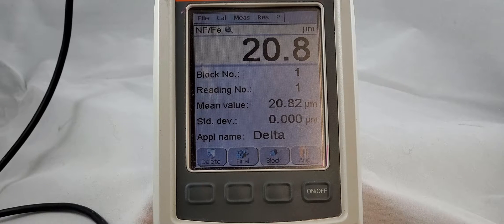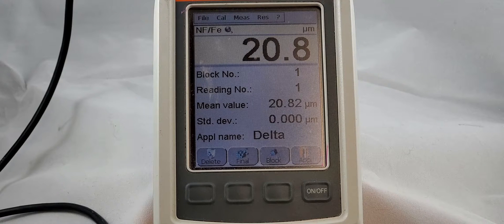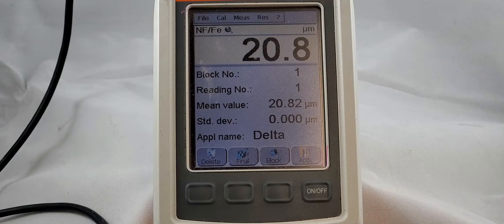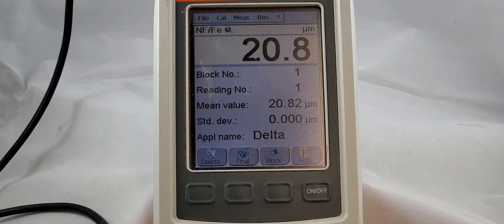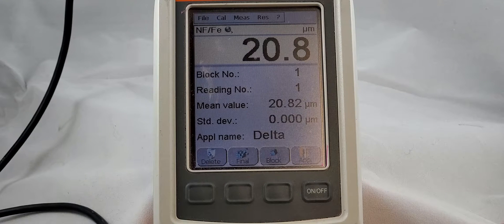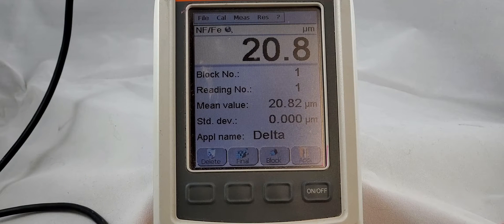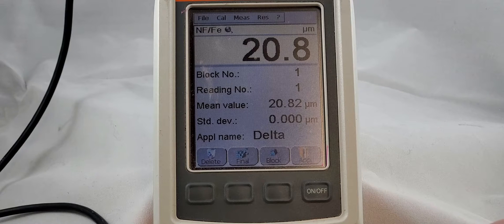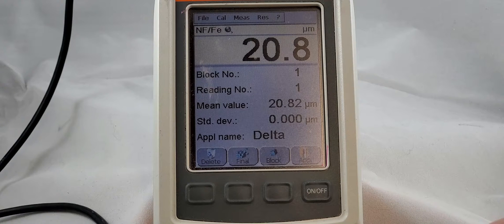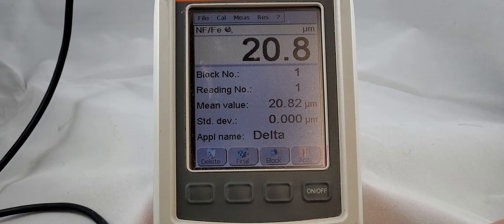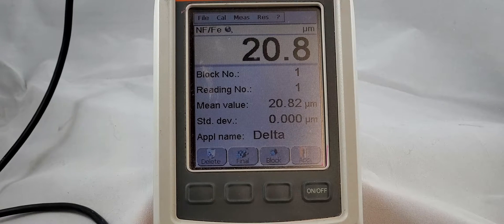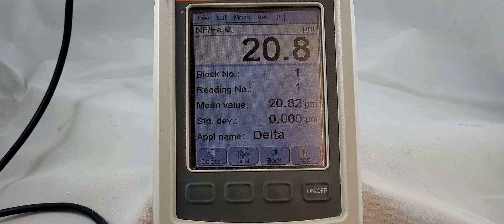For our FMP 100 and 150, the biggest issue and difference is we have a touchscreen. So we're going to go to a few different places. The actual calibration process itself and the things you're going to need for it are the same.